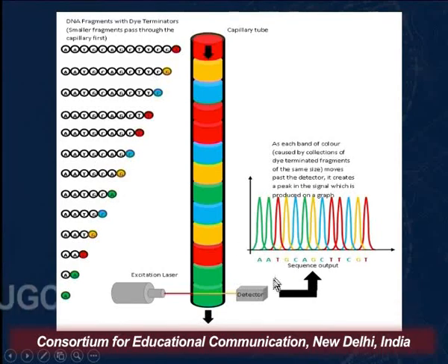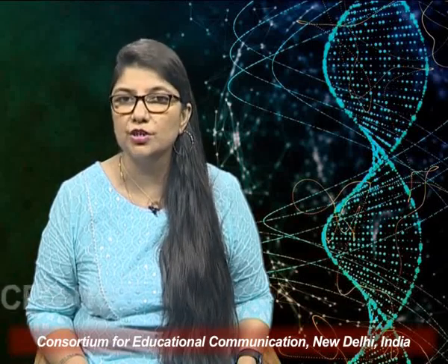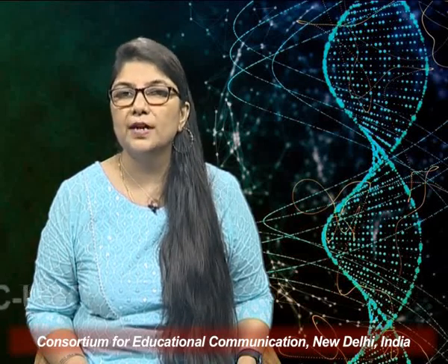This is a very important method. It is still being used, although it is an old method. It was discovered in 1977, and it was such a revolutionary technique that Frederick Sanger got the Nobel Prize in Chemistry. So this is a very revolutionary technique that is used.